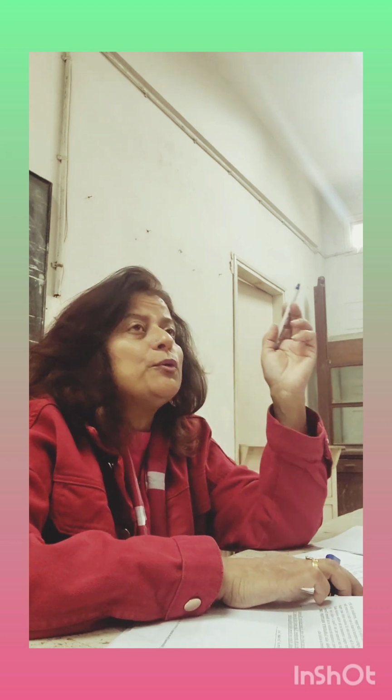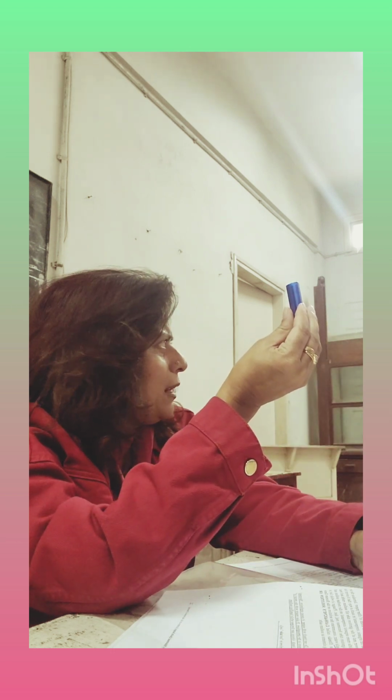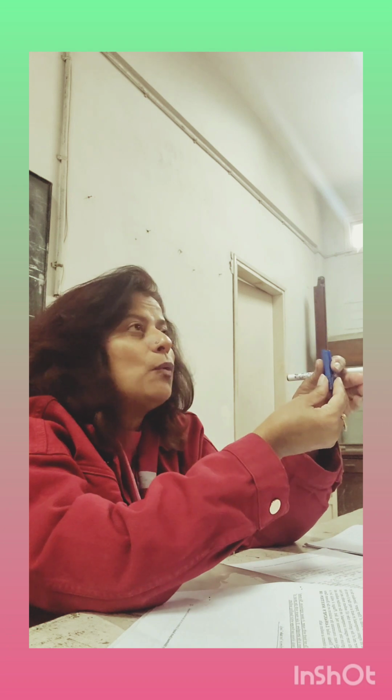Then add concentrated sulfuric acid, 2 drops. Sulfuric acid 2 drops, ferrous sulfate 3 drops. When you are adding ferrous sulfate, add 1 drop and then shake it. Add the second drop, then again shake it and observe if there is any change. Then for the third drop you will again shake it. And then you are going to heat to boil. You will give it 1 boil only. In that boiling solution, you are going to add concentrated sulfuric acid, almost 2 to 3 drops.